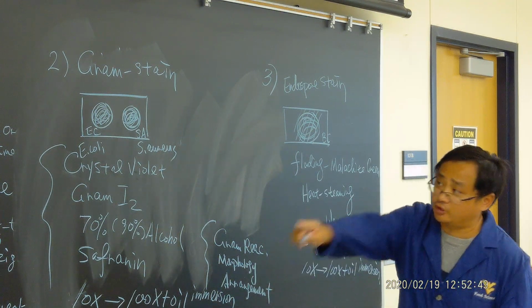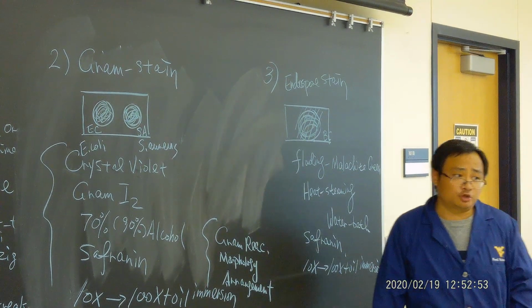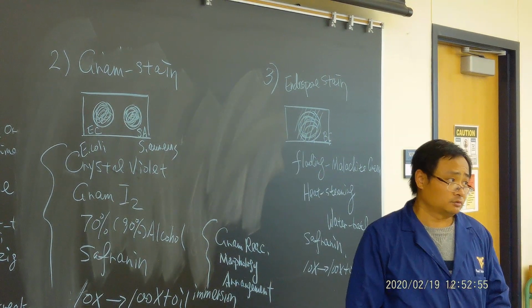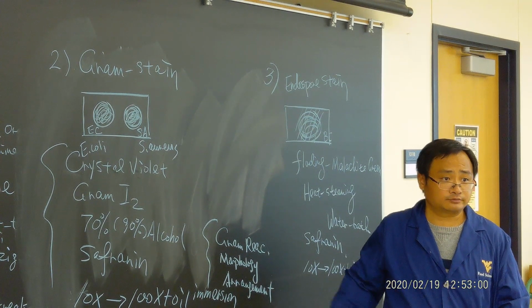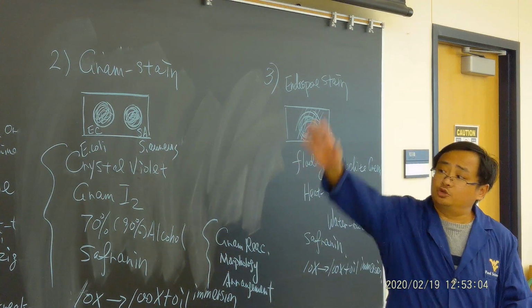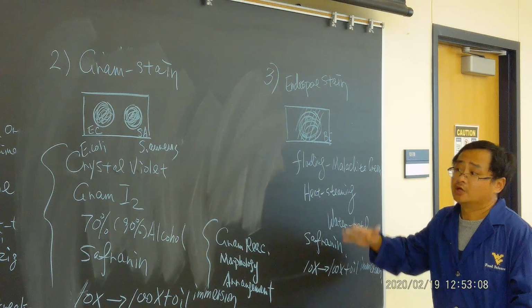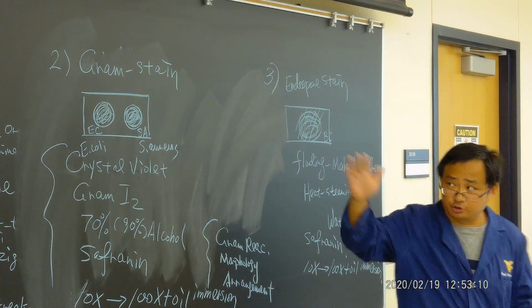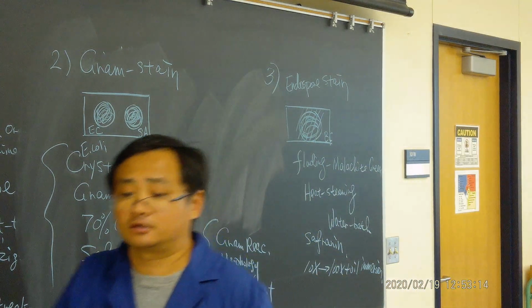Okay, so we finish all this work, together with the simple stain, and next Tuesday I'll go over the results. Okay, so that's what we're going to do. Any questions? If no questions, go ahead and do the transfer first, then the Gram stain slides, the endospore stain slides, then grab a microscope to do the observation. Okay, that's the procedure. Good, that's all I have.